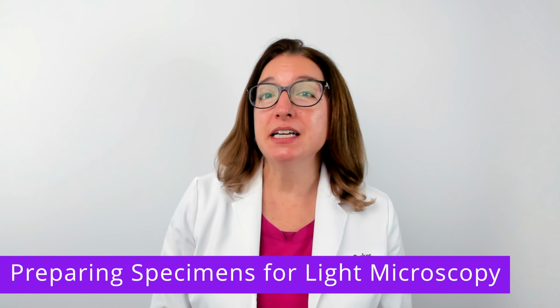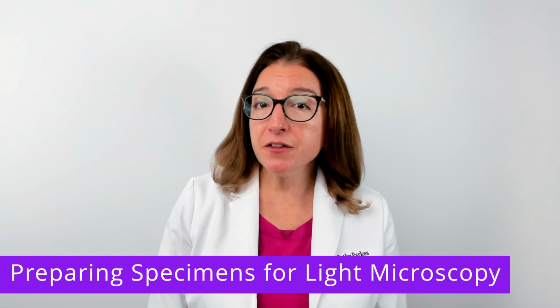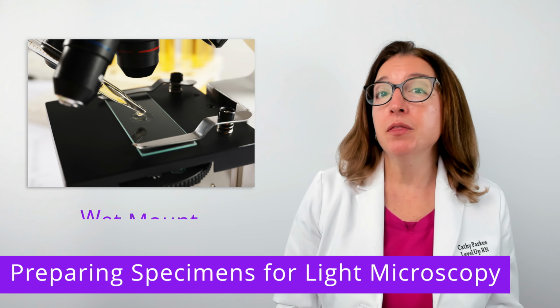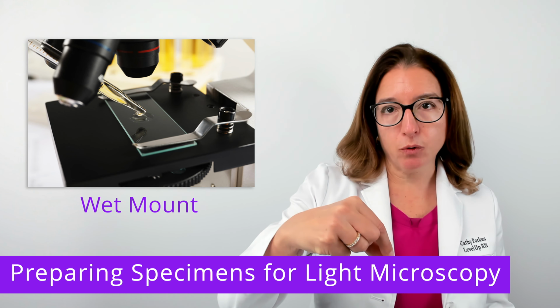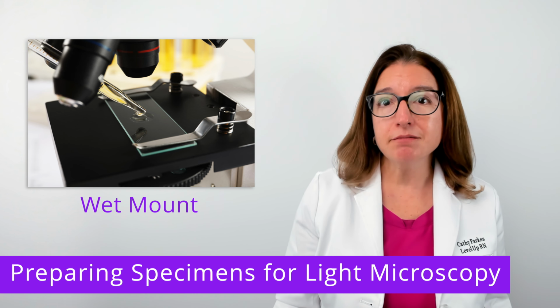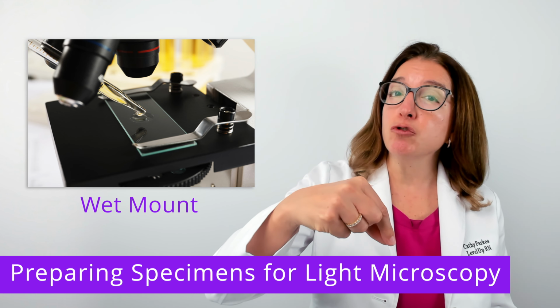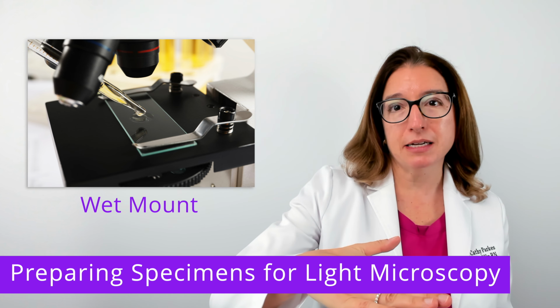Before we can observe a specimen using a bright field microscope, we need to first prepare the specimen using wet mount or fixation. With wet mount, the specimen is placed on the slide in a drop of liquid. If the specimen is already in liquid format, such as urine, you can just place the specimen on the slide using a dropper. And then afterwards, we would put a cover slip over the specimen.